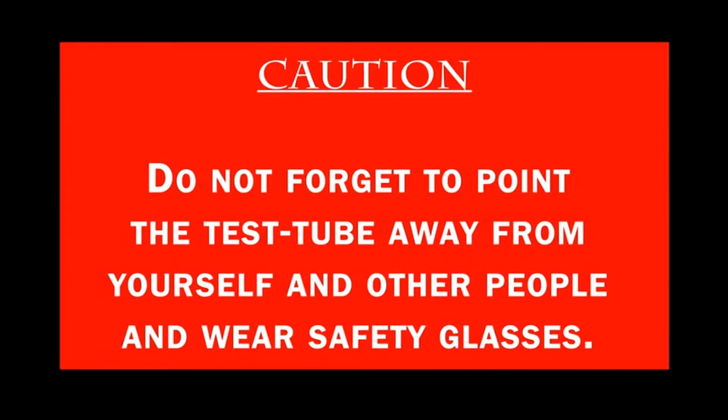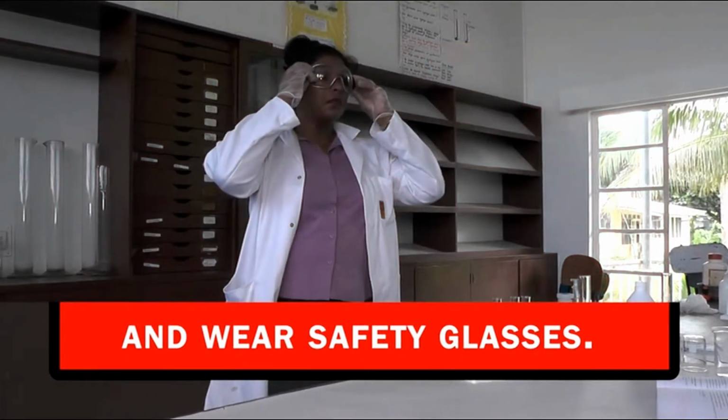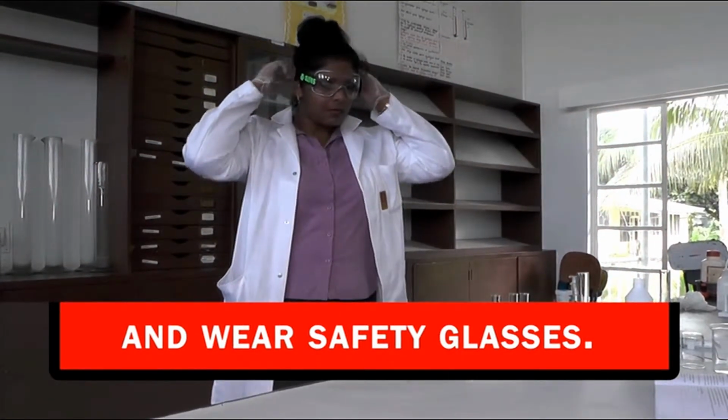Now, do not forget to point the test tube away from yourself and other people, and we should be wearing safety glasses.